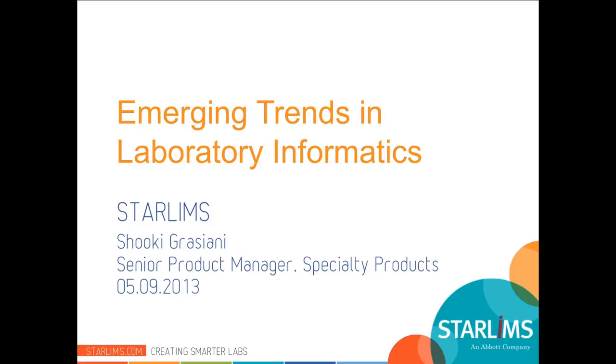I would like to spend the next 10 minutes to not only discuss the emerging trends in laboratory informatics, but also to look at the purchasing considerations that you should be aware of when you evaluate the different options in correlation to these emerging trends.